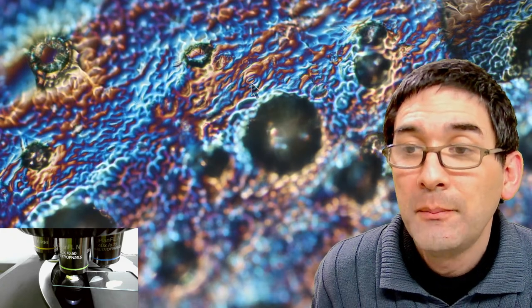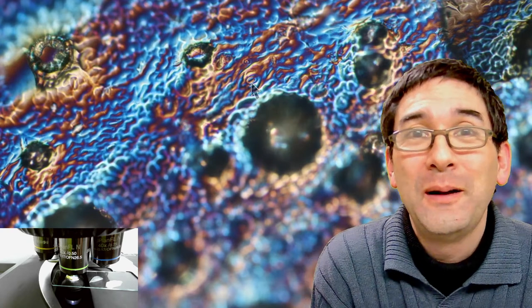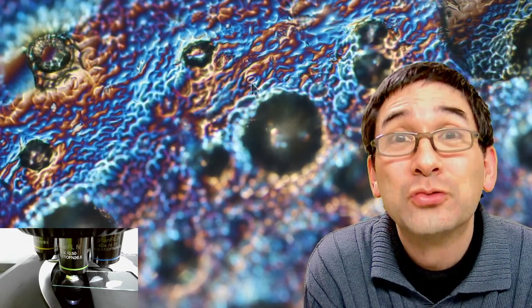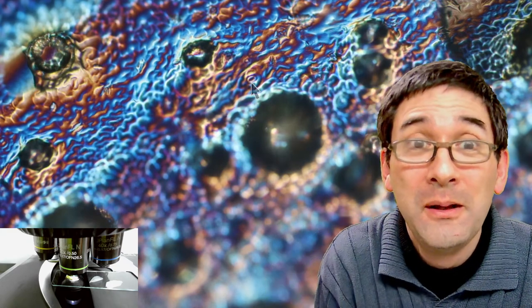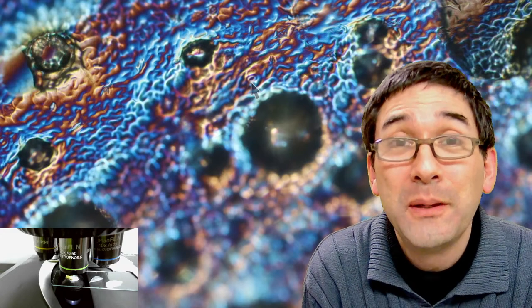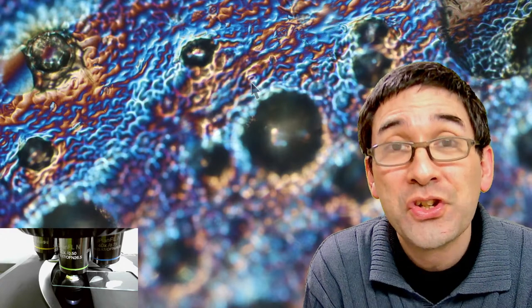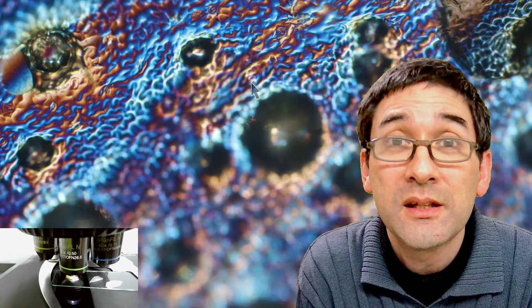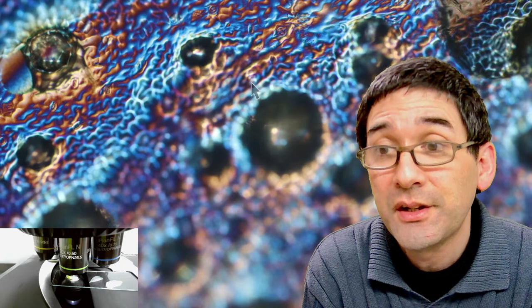Where do you find hydras? There are two places. One place is from a colleague who has many aquariums at home. He said they're growing not only on the plants but also on the glass of the aquarium, and hydra sometimes are a big problem because they grow rapidly. I also found some hydra on water samples — if you get some plant material from a pond, if you're lucky you're also able to find hydras there.